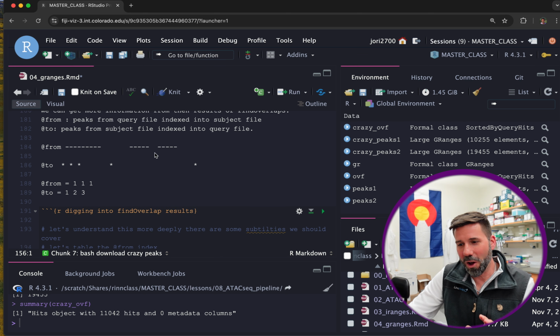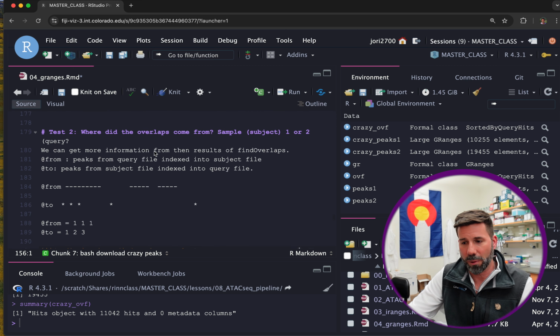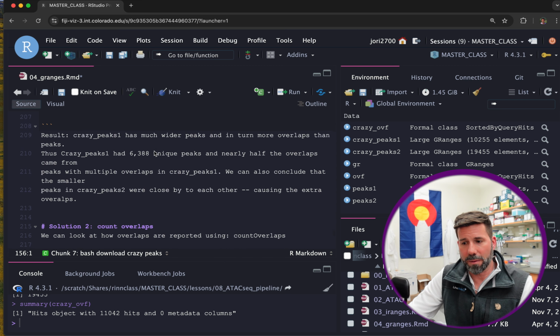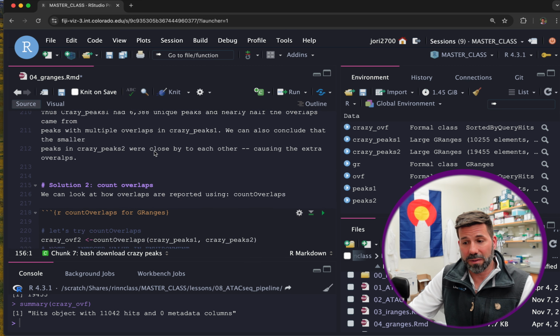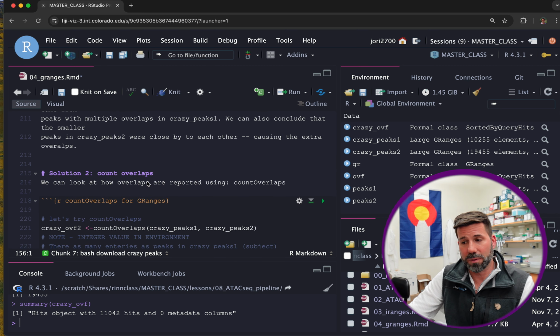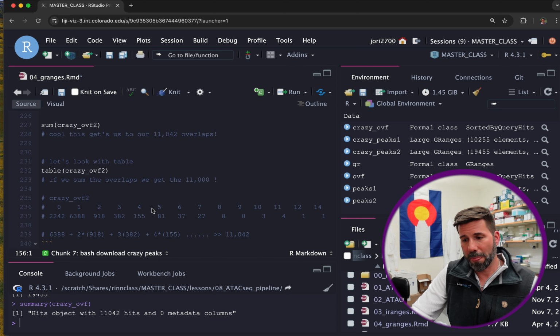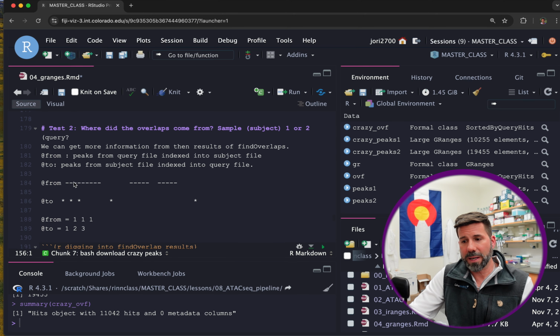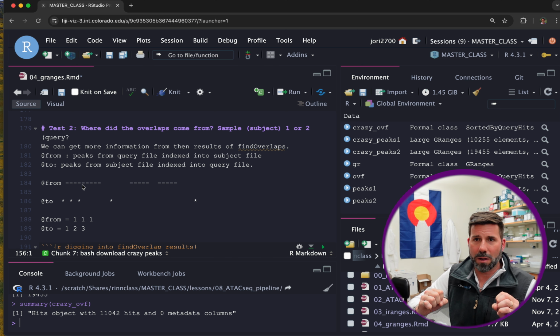It's all written out here and spelled out in detail, because this was the exercise where I learned how important it is. Again, it is a lot of detail, but if you really want to keep moving forward with your computer science, this is 2 solutions to figure out how to think about this. And just as a conceptual solution, what can happen, like we saw, is that my first replicate had a really big peak, and my second replicate had 3 small peaks called.